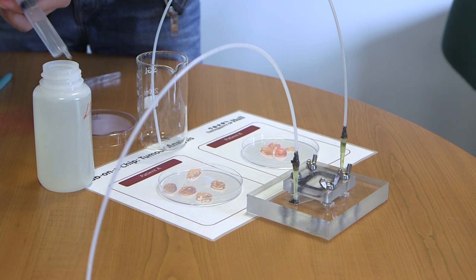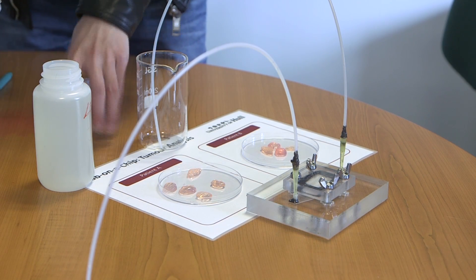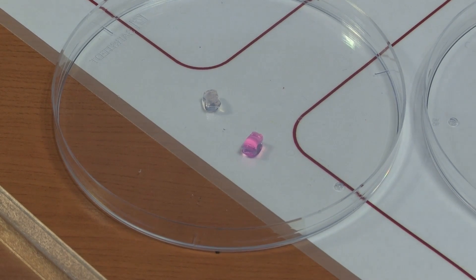We then flowed two different solutions over them, acting like the drugs, and where you saw a colour change, that is the drug acting on the tissue and reducing the proliferation or the growth of the tissue — so therefore you're kind of stopping the cancer in its tracks.